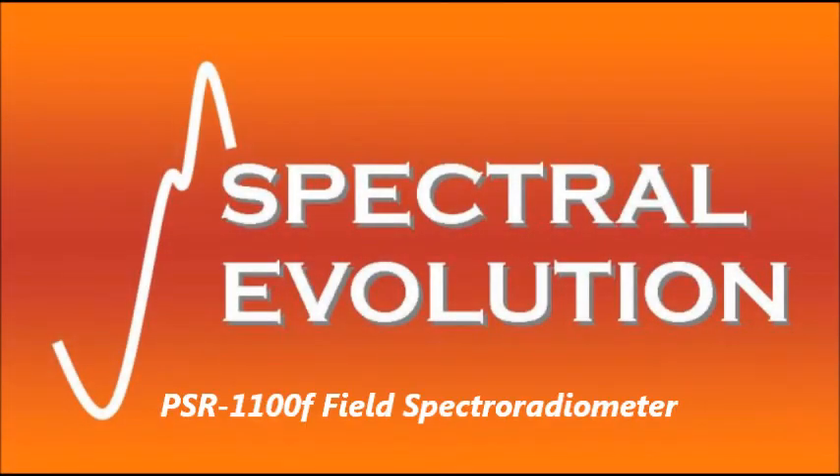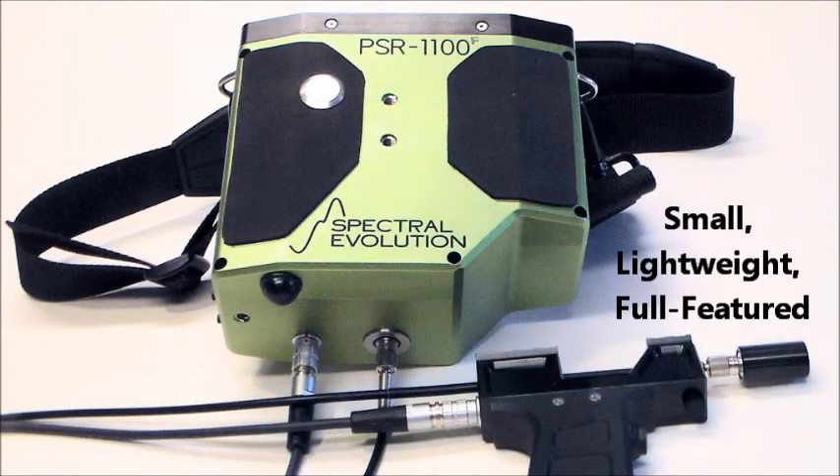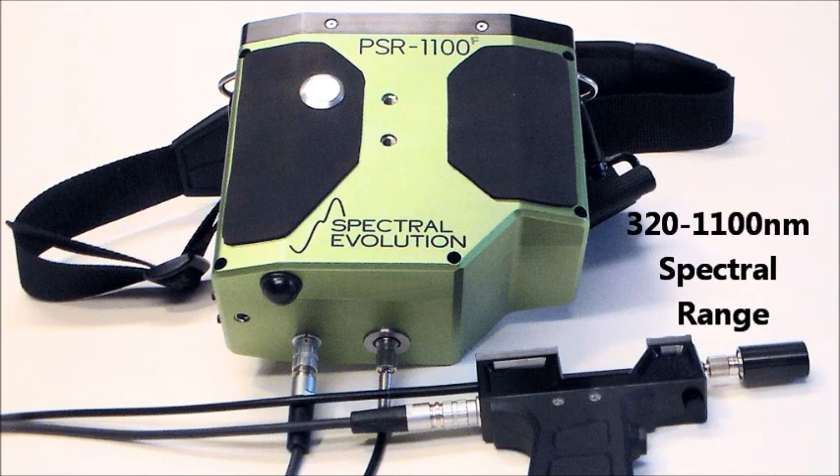The PSR 1100F is our smallest and lightest full-featured field portable spectroradiometer, with a spectral range from 320 to 1100 nanometers. It has a rugged anodized aluminum case for reliable field performance.